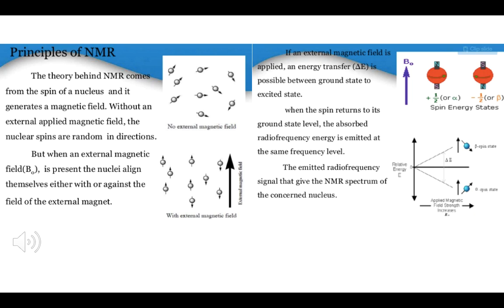So if you look at an NMR, the further you are to the left, you are downfield, deshielded. The further you're to the right, you're upfield and shielded. The more upfield and shielded you are, the closer you are to 0. And the more downfield you are, the more deshielded you are, up to about 13. You can use different standards, but the standard that most people use is TMS. And I think TMS is just a silicon with multiple carbons.